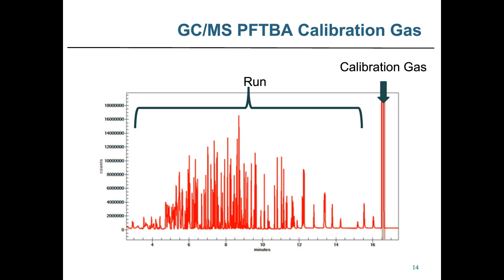You don't have to do the calibration within the same run. That's one way to do it. You could also, since the instruments are quite stable over a period of a few days, typically run a calibration in the morning and then perform your runs throughout the day, and the calibration holds fine.